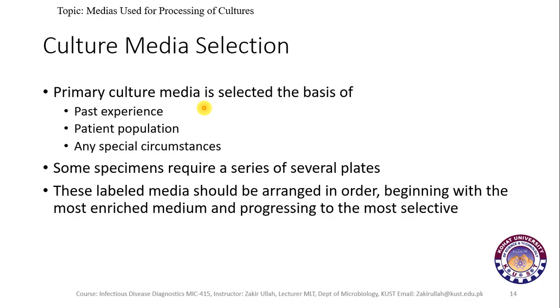The primary culture media is selected on the basis of past experience, the patient population, and any special circumstances. Primary culture media is that type of culture media which is required for the initial inoculation of the sample.